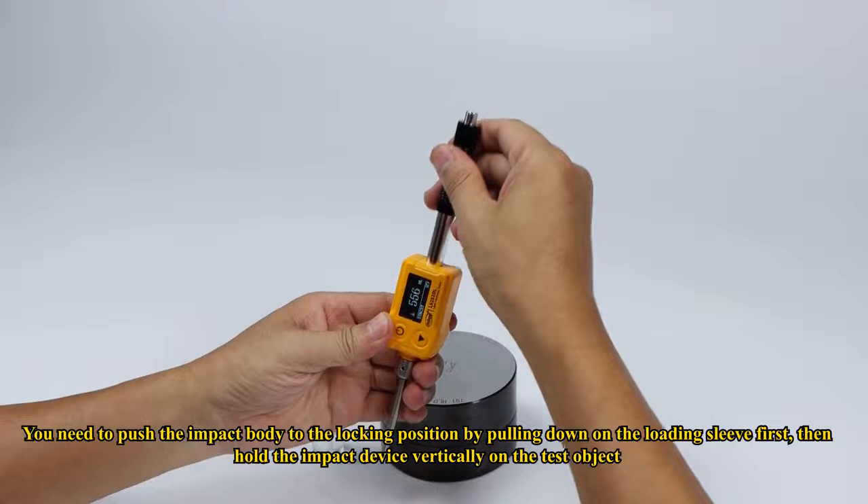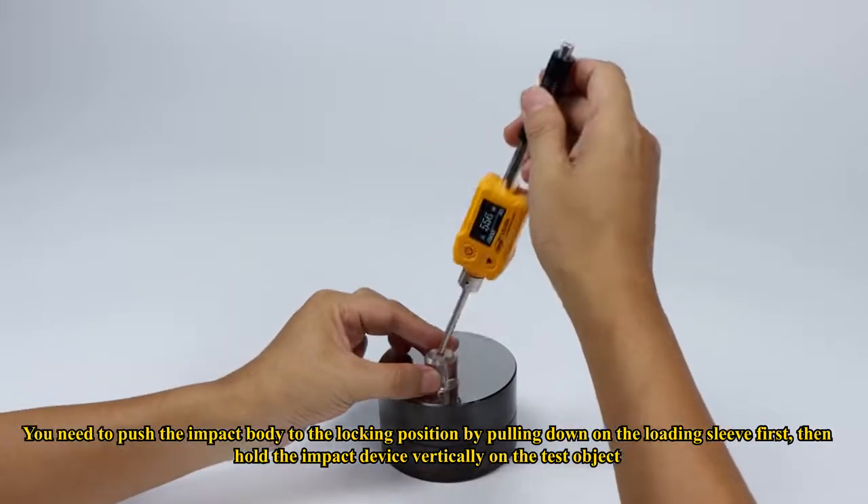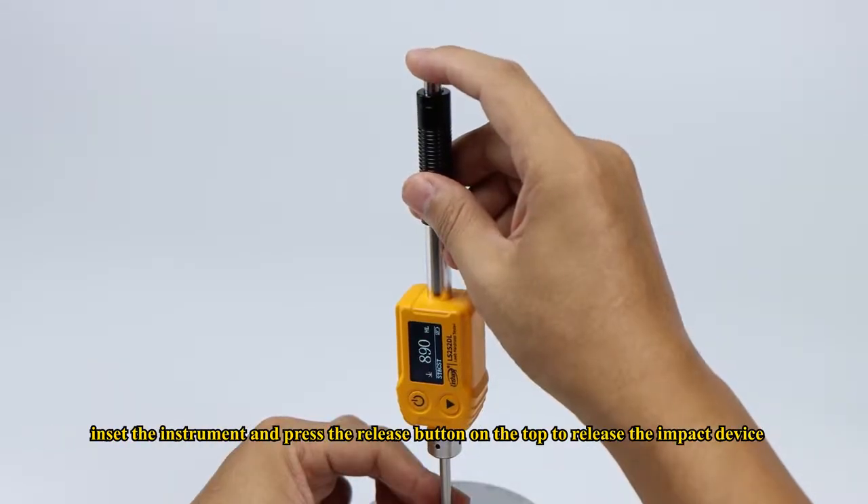Push the impact body to the locking position by pulling down on the loading sleeve first, then hold the impact device vertically on the test object. Insert the instrument and press the release button on the top to release the impact device.